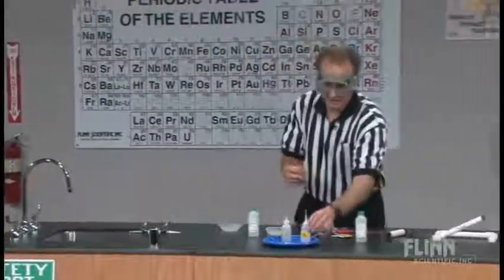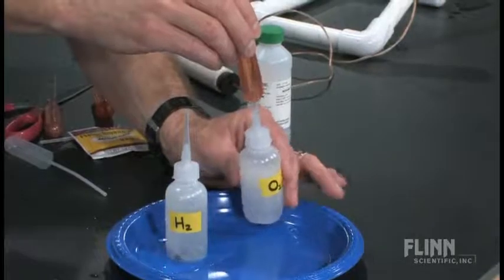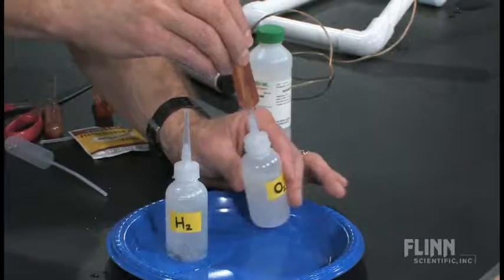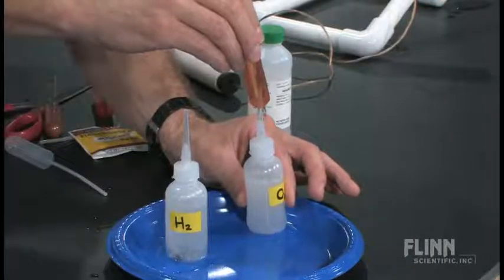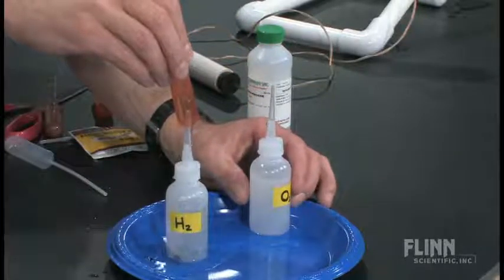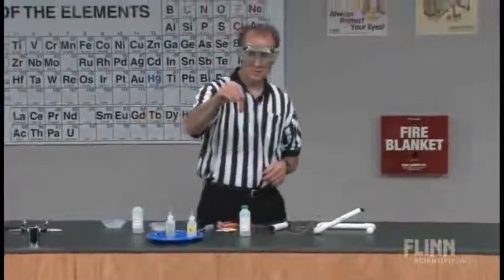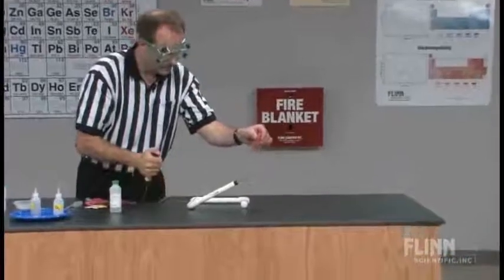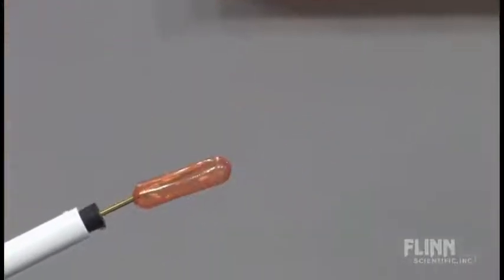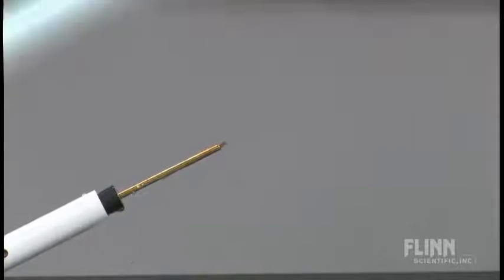Students will sometimes ask: does it make a difference which gas is added first? We can try that as well. I'll start with oxygen. We can squeeze this a little bit to push that oxygen out, and over to the hydrogen — twice as much needed. Up we go — small amount of water still in the bottom. I see sparks on the end, and firing! There we go. Three for three — this is a great day.